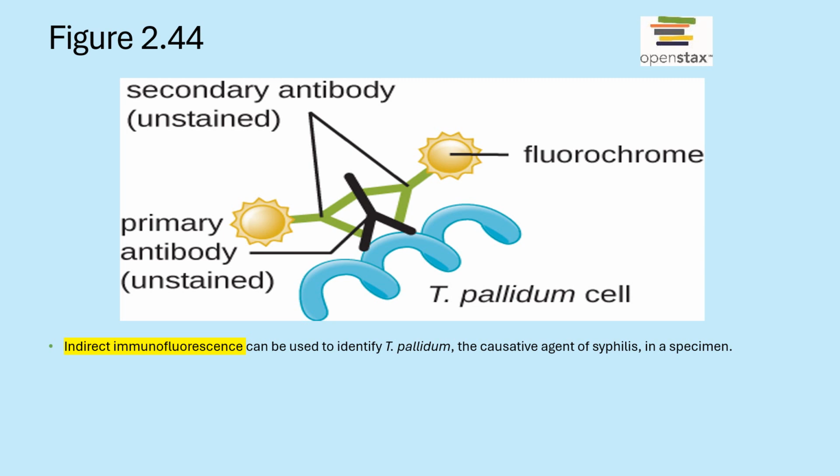Everything is to help you to see the microorganisms, because once again, what we're looking at, you can't see with the unaided eye. So these are techniques over time that have been developed for us to be able to see and sometimes differentiate between one strain or another.